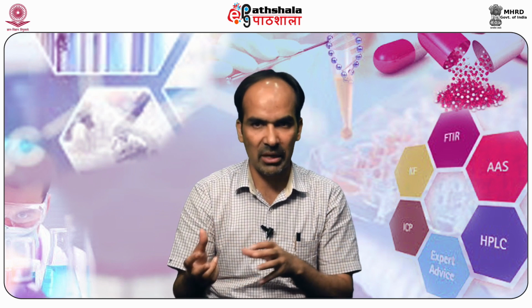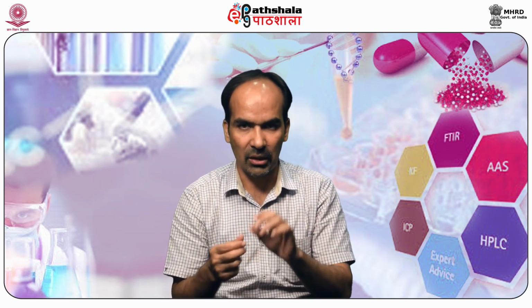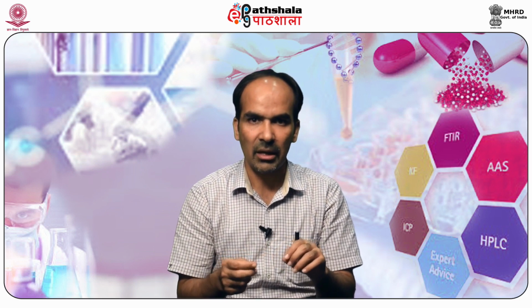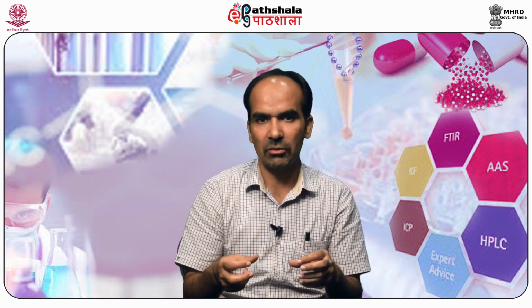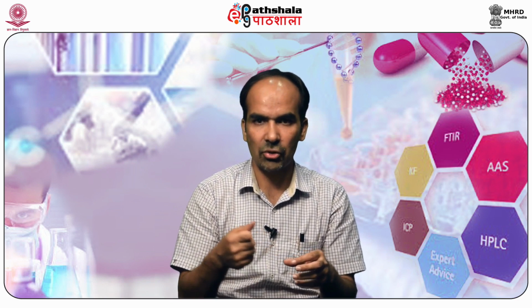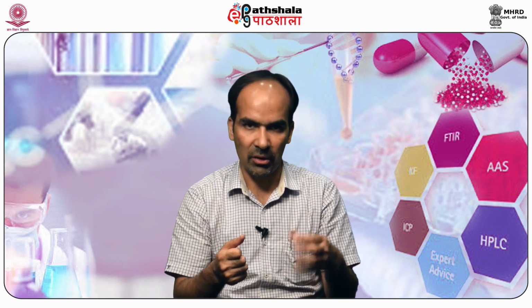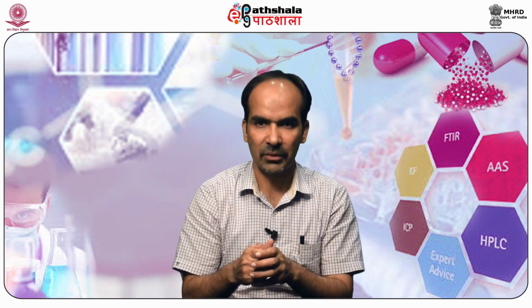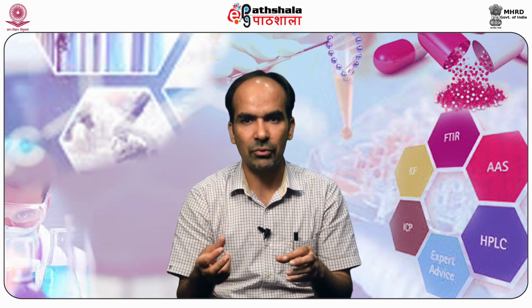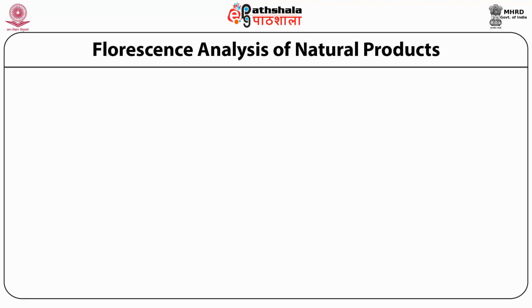A tungsten arc or a mercury lamp can be used as a source of UV light. Then we have filters to single out some of those short UV waves. And then a photoelectric cell is used to measure the intensity of the emitted fluorescent light. We also have these fluorimeters in the form of long and short wavelength handheld lamps, which can be used on solid samples, liquid samples, as well as on chromatograms. It can be used for both qualitative as well as quantitative analysis in solid, liquid, or powder samples. The use of fluorescence analysis for the analysis of natural products.